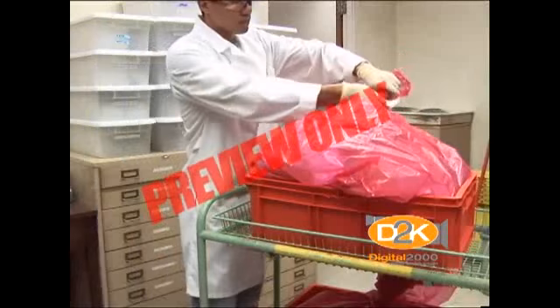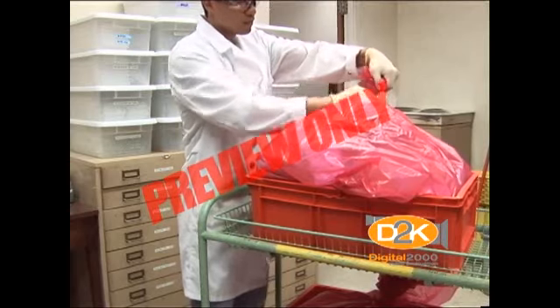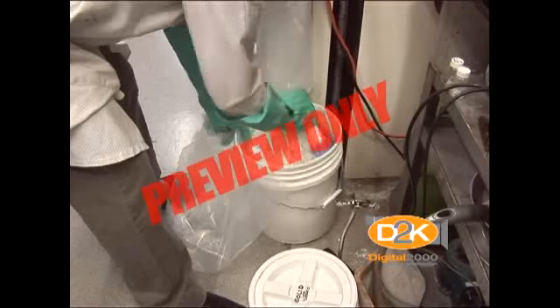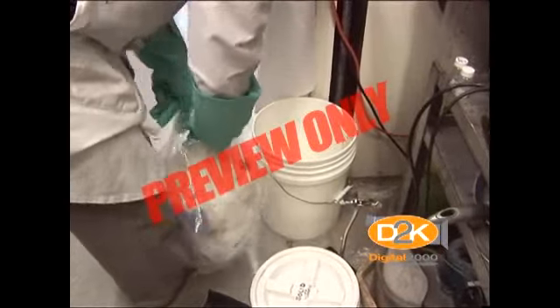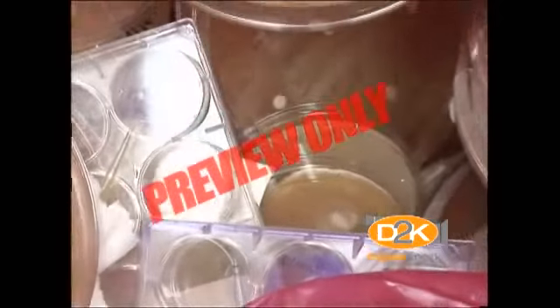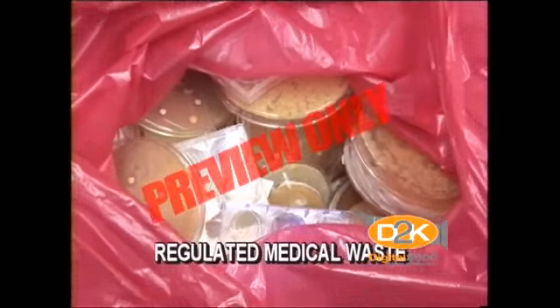However, if this waste contains any hazardous chemicals, such as heavy metals or organic solvents, it must be handled as hazardous waste. Similarly, if the biosafety level 1 waste contains radioactive materials, it should be handled as outlined in your Radiation Safety Manual. Biosafety Level 2 waste is biohazardous and must be treated as regulated medical waste.